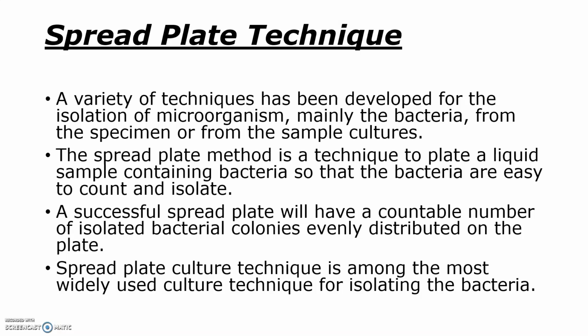A successful spread plate will have a countable number of isolated bacterial colonies which are evenly distributed on the plate. So this technique is among the most widely used culture techniques for isolating bacteria, because we can count the number of isolated bacterial colonies which are evenly distributed.